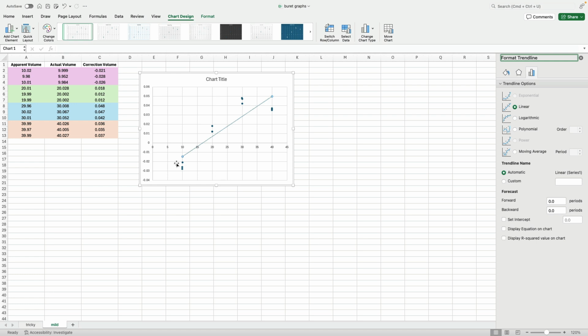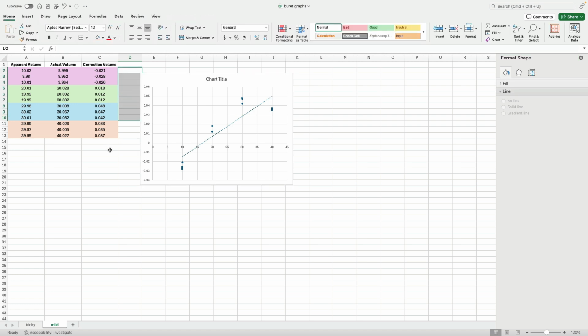Again, we want to make one trend line here for these three sets, to make all these three sets linear, because that looks like it might be linear. So we want one trend line that goes for all this stuff right here. And then we want a trend line that runs between these two sets of points, which means we need these two to have a trend line. Okay, so keep that in mind.